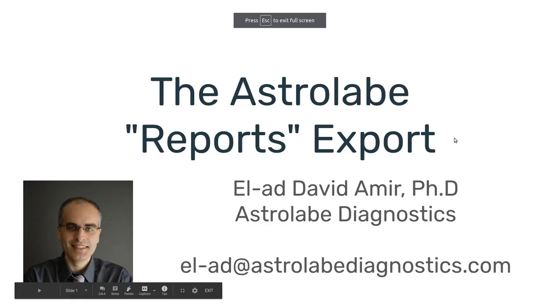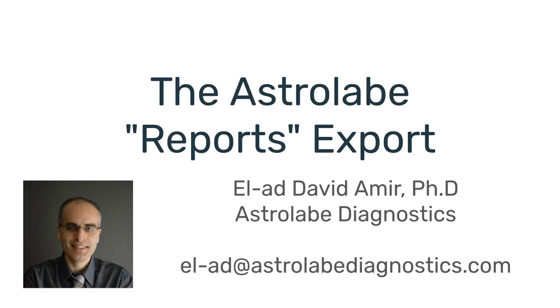So again, we're dedicated to transparency. This is your data, this is your analysis, and I hope I conveyed how the reports export is another way in which you can explore the different trends in your study.